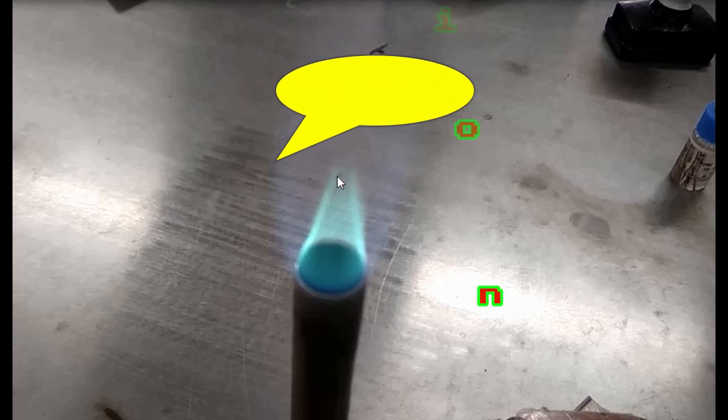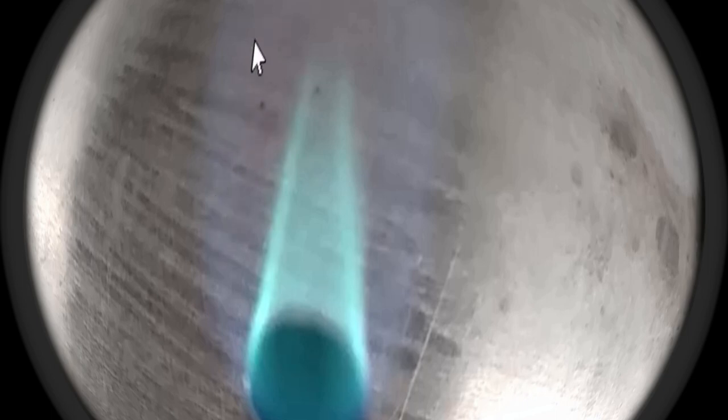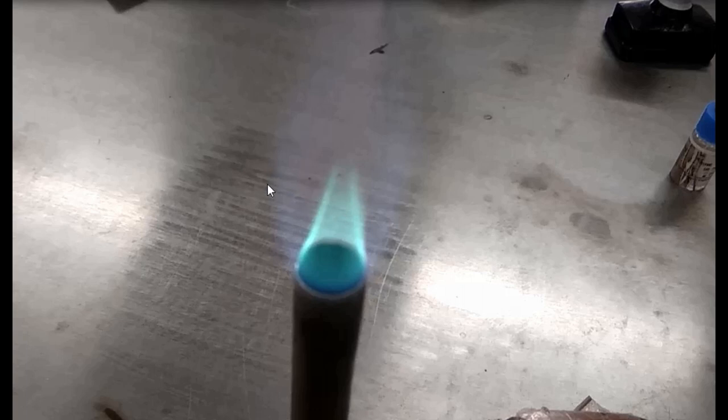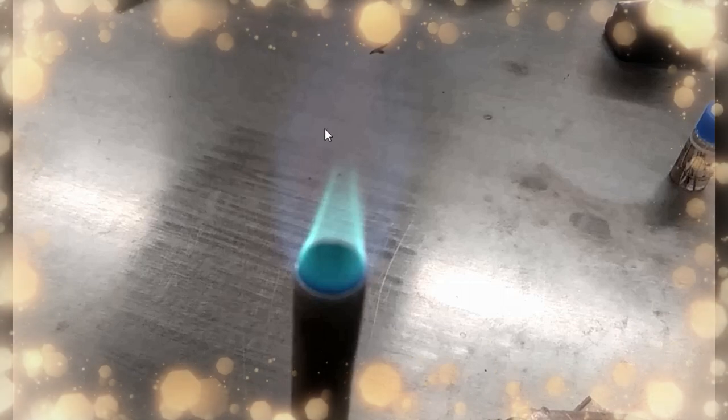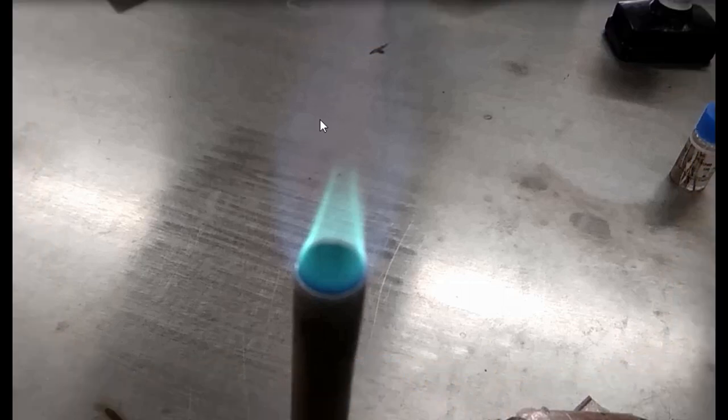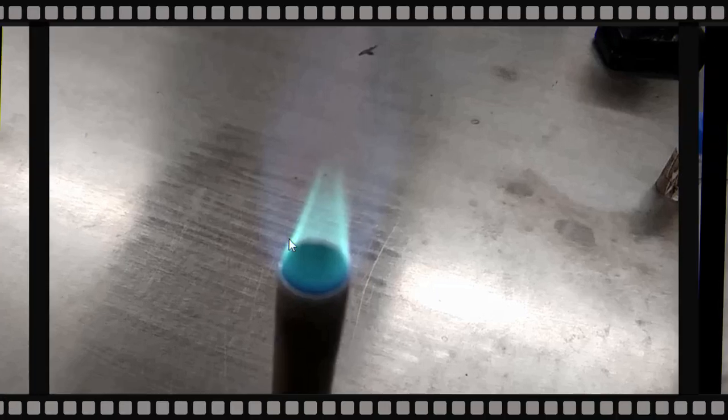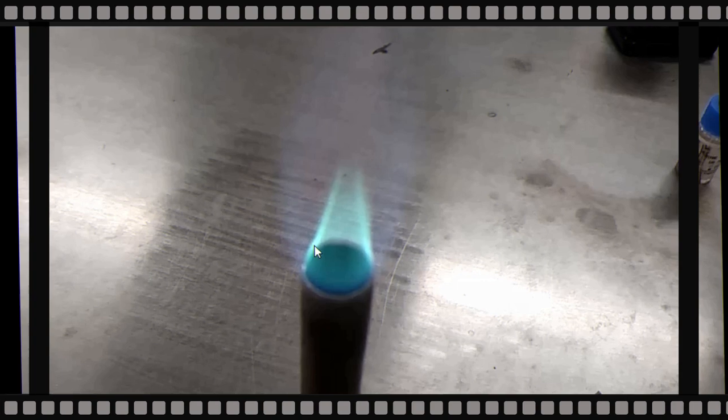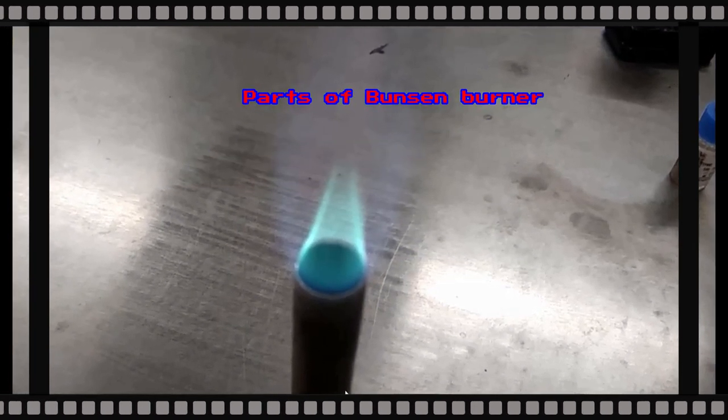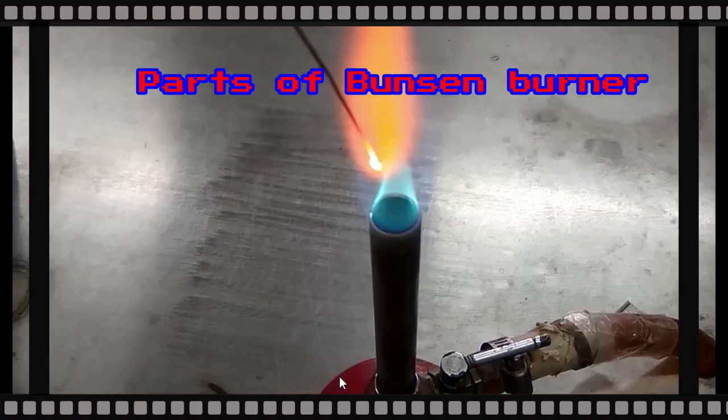A Bunsen burner, named after Robert Bunsen in 1852, is a common piece of laboratory equipment that produces a single open gas flame, which is used for heating, sterilization, and combustion. Now about its parts: it contains a base, this one is the base, gas inlet, this one is the gas inlet.